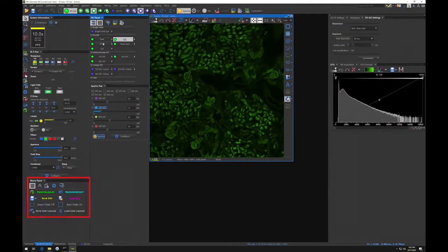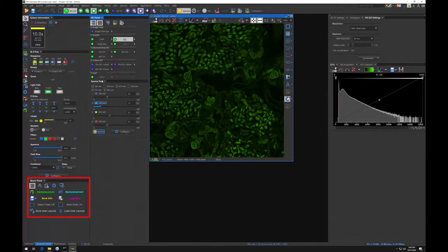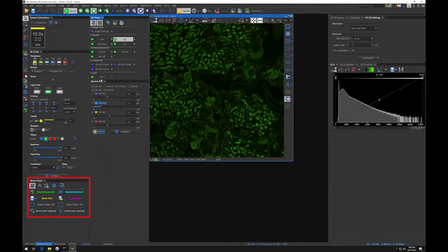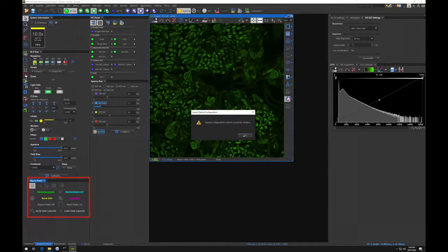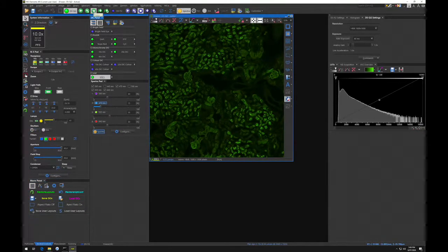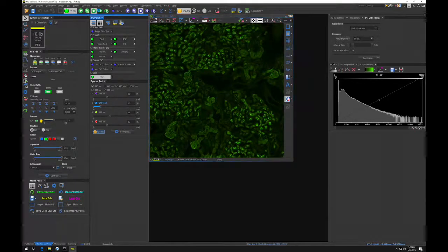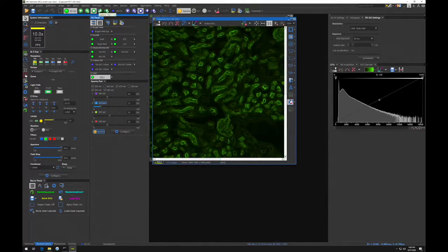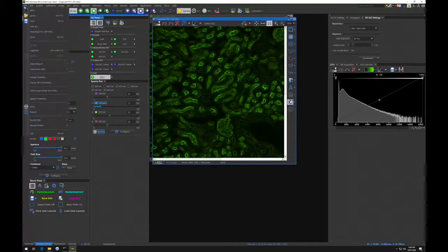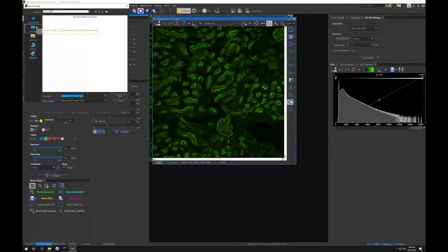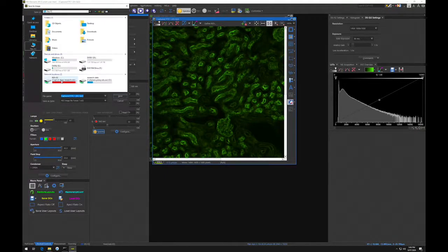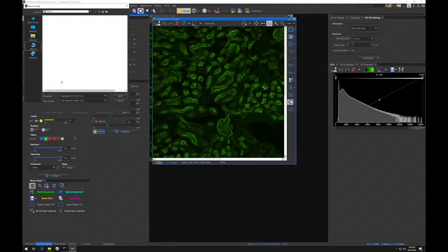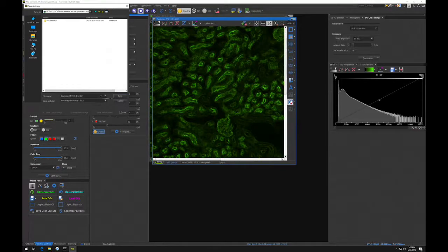You can save your OCs using the save user OCs macro button. Now that you have optimized your settings, press the capture button to capture an image. To save the image, click file, then save. Always save the ND2 proprietary format, because this will save your metadata.